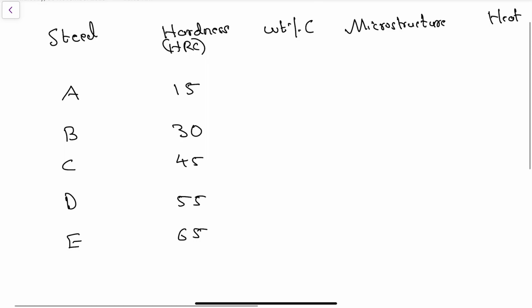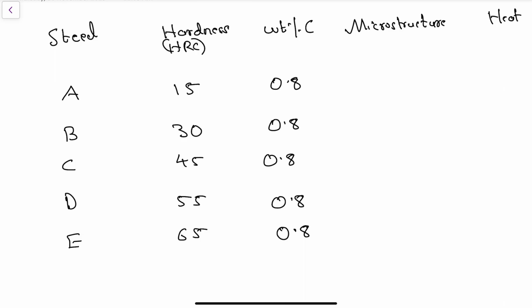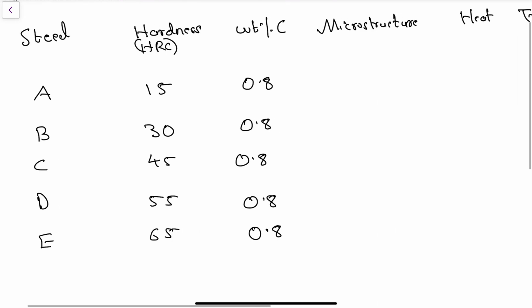So I measured the carbon content, but surprisingly, I found that the weight percentage is only 0.8. The carbon content is only 0.8%. That means there is no change in the percentage. Then I inspected the microstructure.